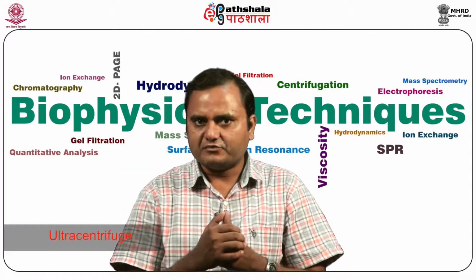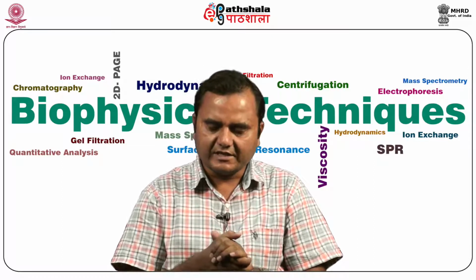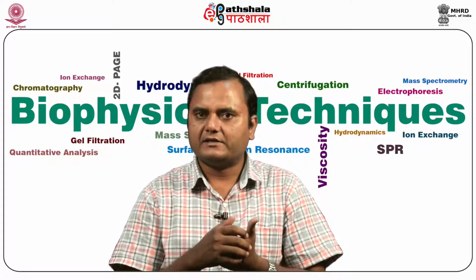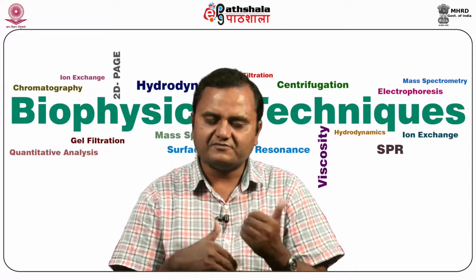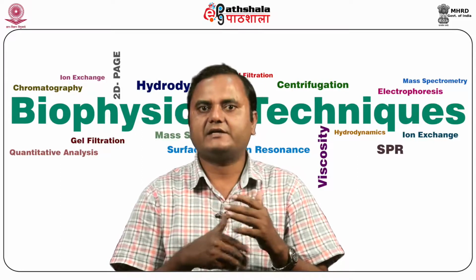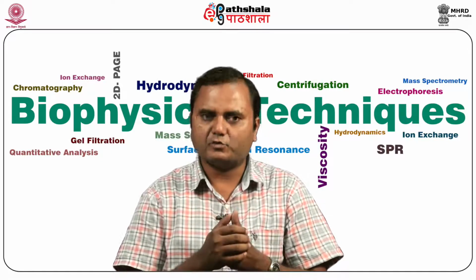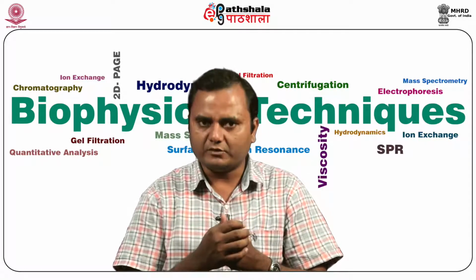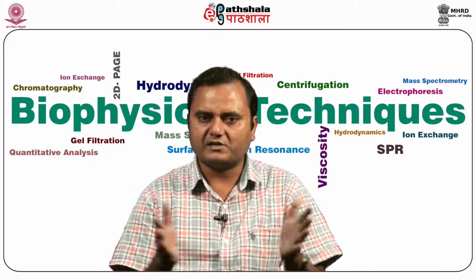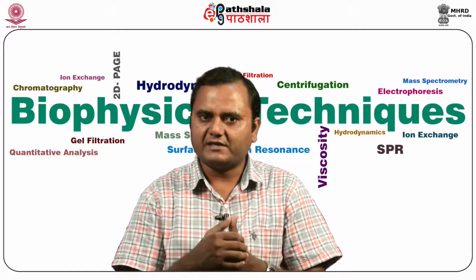So the ultracentrifuge is actually the most advanced form of the centrifuge, and it is a very costly technique. It is actually an additional advancement, additional features applied to the normal centrifuge, and these features are in terms of the speed. Here you can run at more than 100,000 g, which is mainly helpful for separating biological molecules from each other. It has both applications, preparative and analytical.